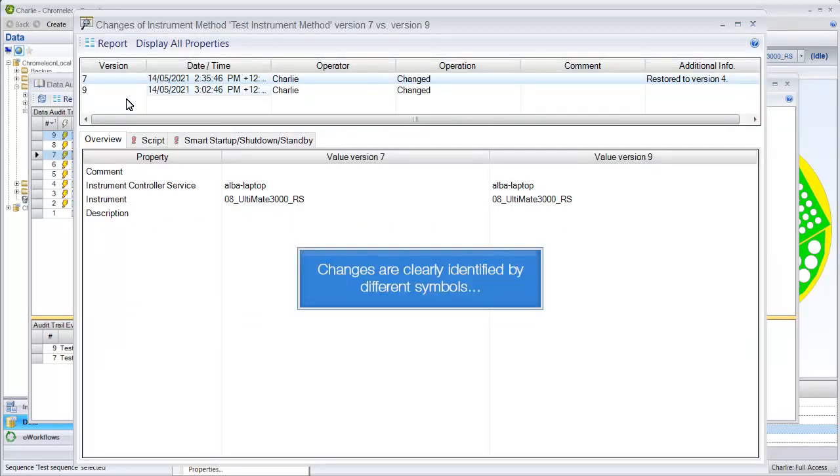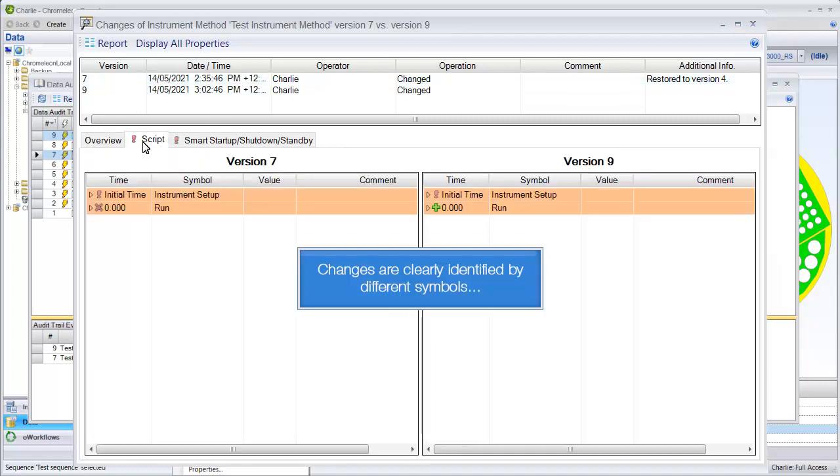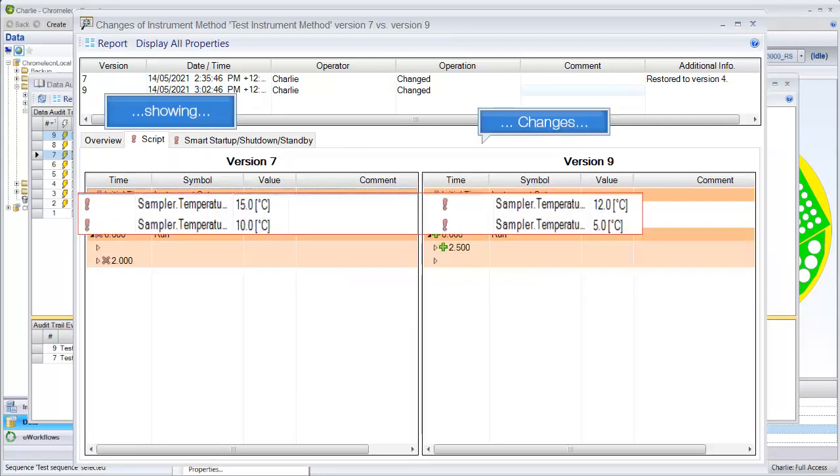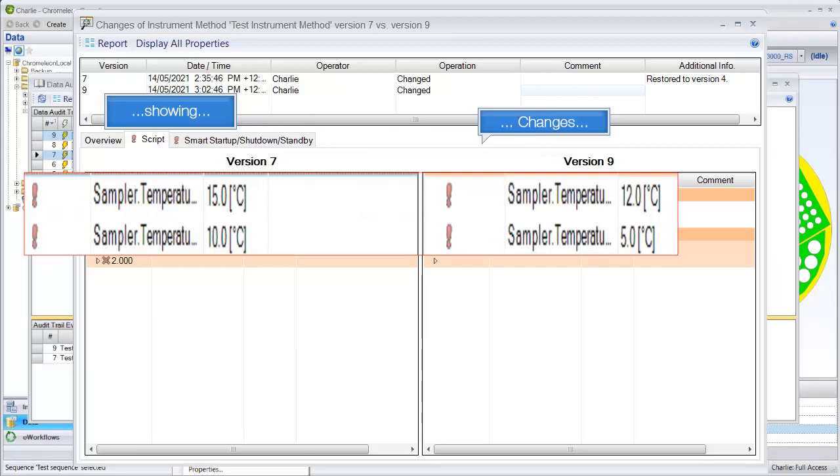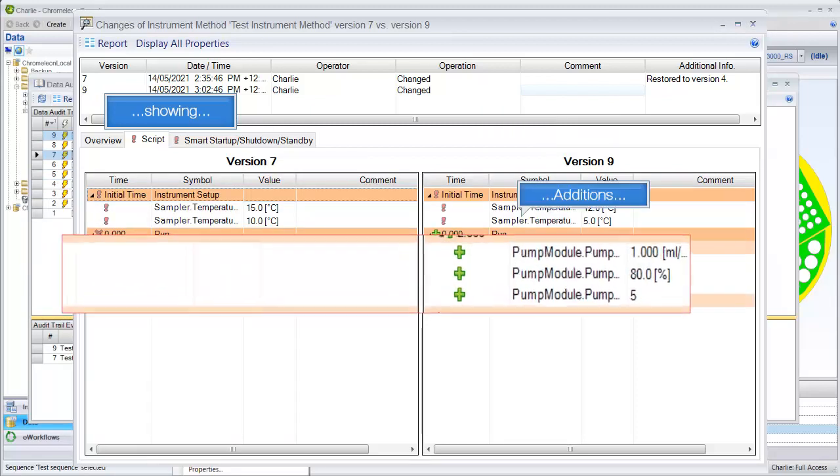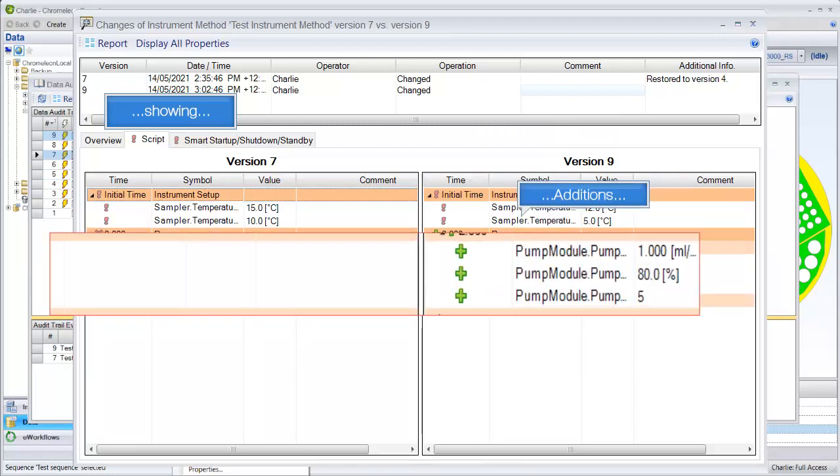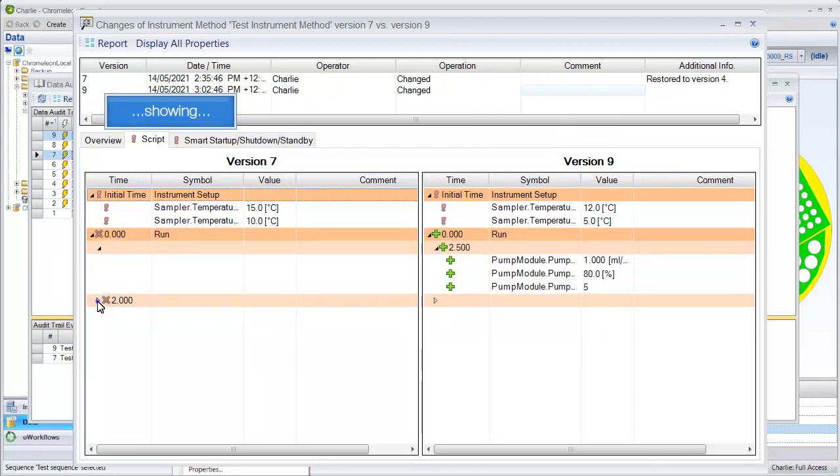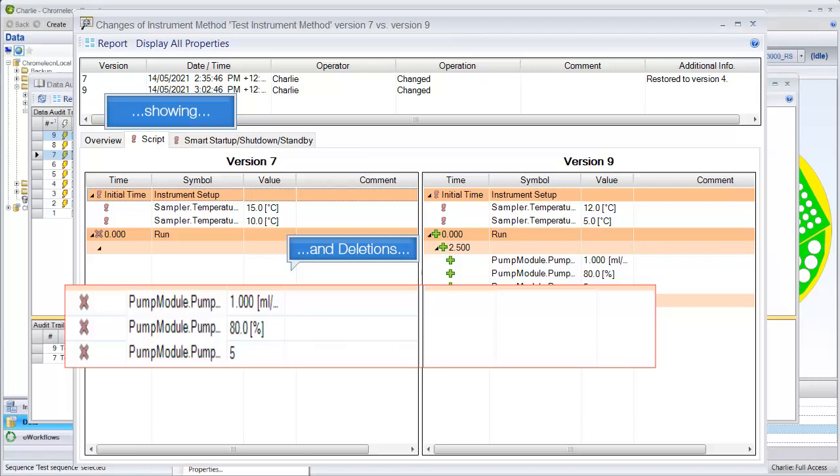Changes are clearly identified by different symbols, showing any changes, additions, and deletions.